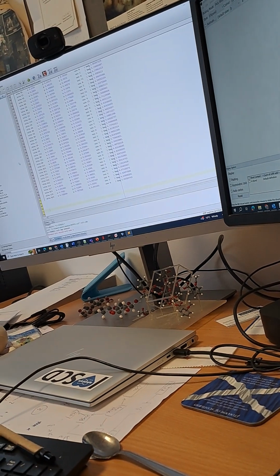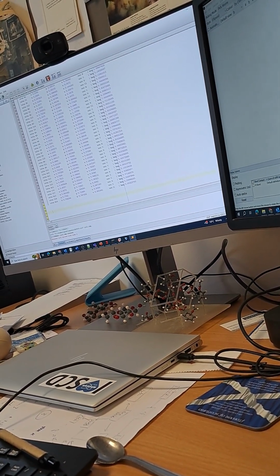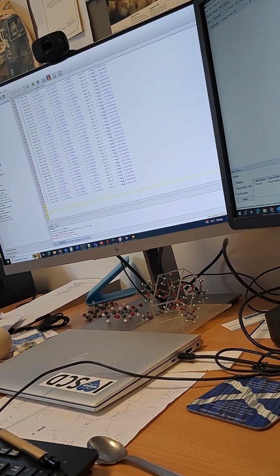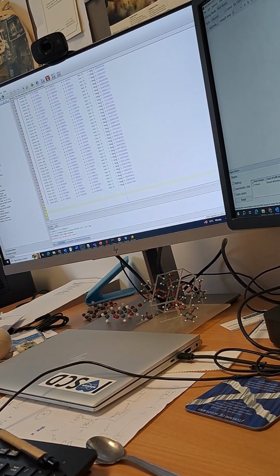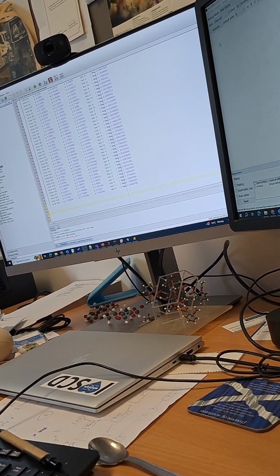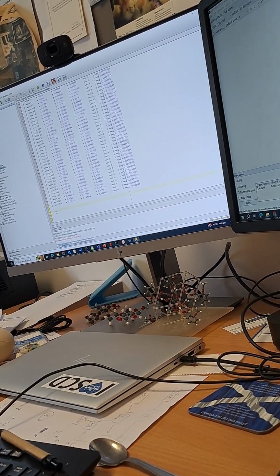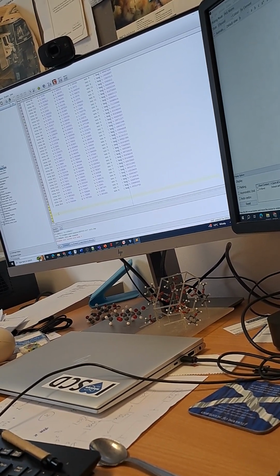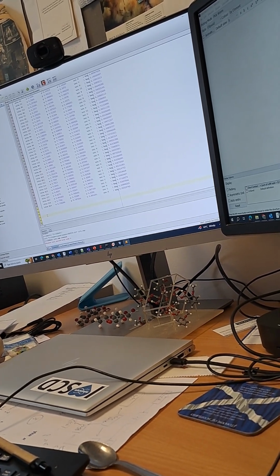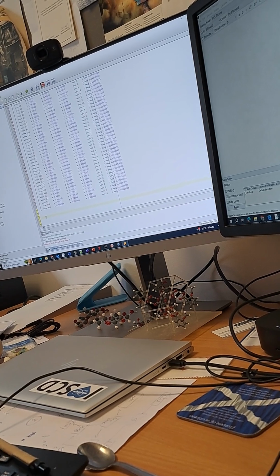Okay, if for example you want to add in the hemihydrate, has that got a name, or is that MiCONZ02? Right. Okay, so here for example, let's just save that. Similar thing. So what are we needing to add? We're not needing to add any data, we're not needing to add any instrument parameters. All we wanted to do is add a structure.